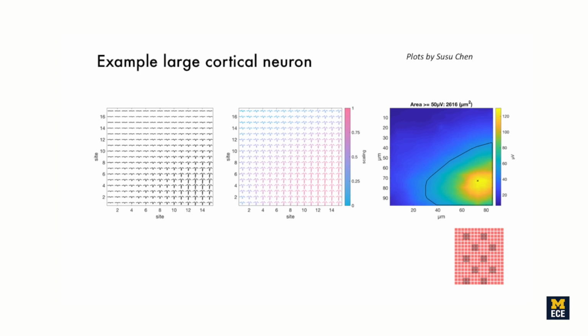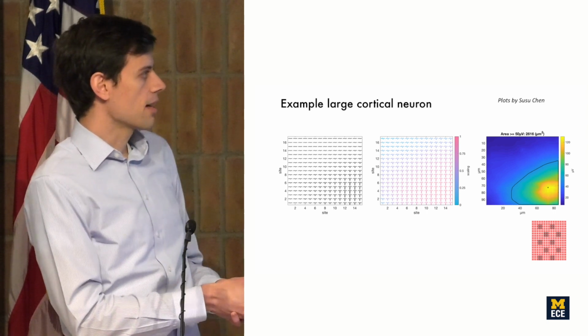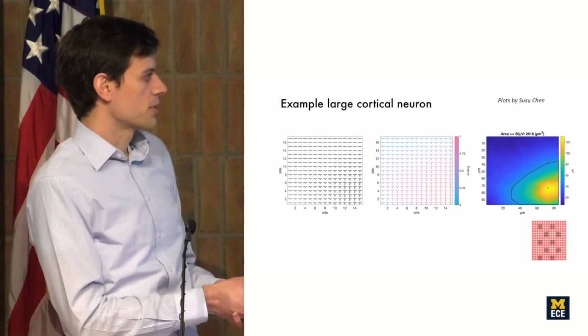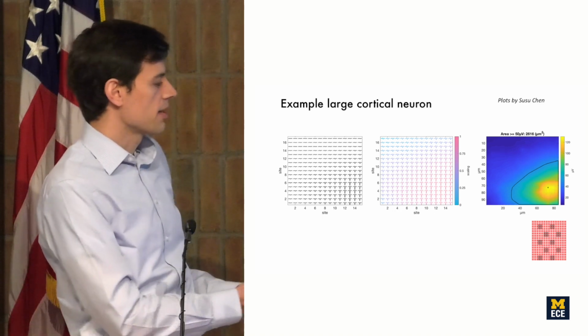And you can see that this neuron had a large waveform on lots of recording sites and a small waveform then as you got further away from the presumed center of the neuron, or the soma of the neuron. Here, on the right, we're abstracting just the amplitude, peak to trough amplitude on each channel as a color map. And you can see the peak amplitude is about 130 microvolts, and then there's a considerable expanse where the amplitude is high enough to see it well on each site.